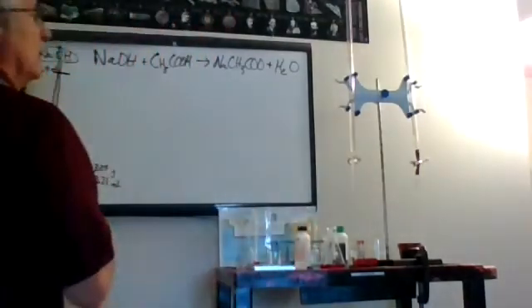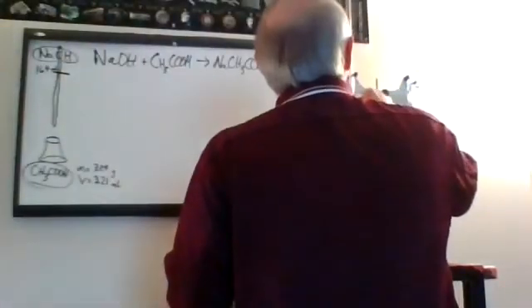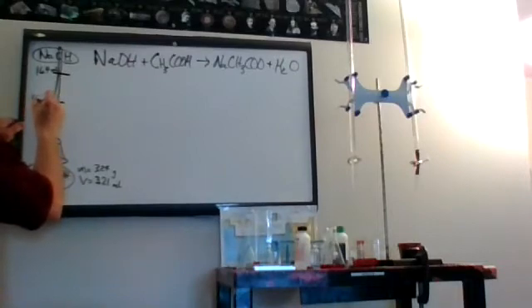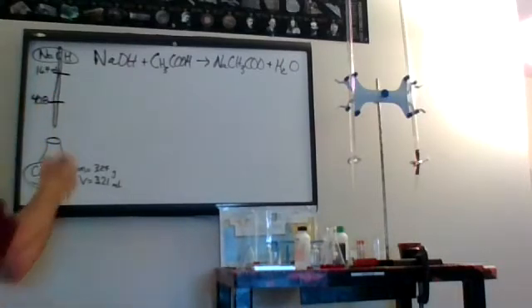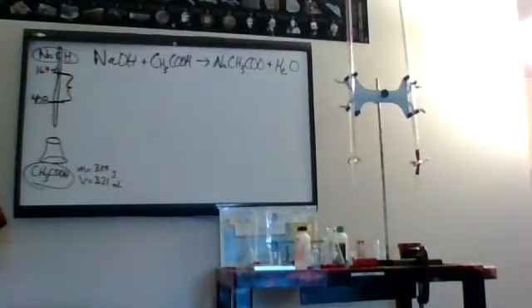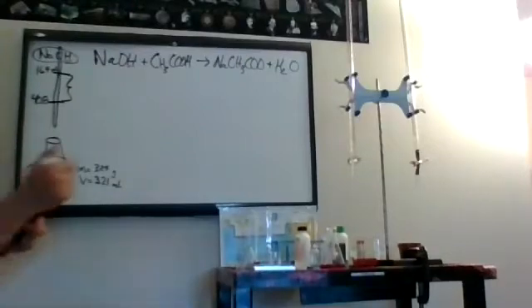How many moles of sodium hydroxide were used? Well, I got to read this thing. It reads 40.8. So how many milliliters did I drain down out of that thing? Well, let's see. That's 40.8 minus 16.4. 24.4.